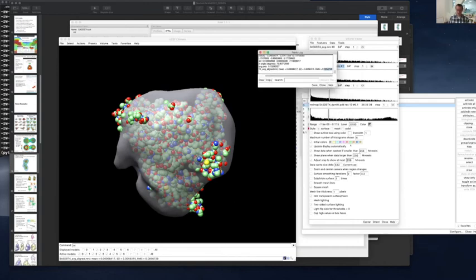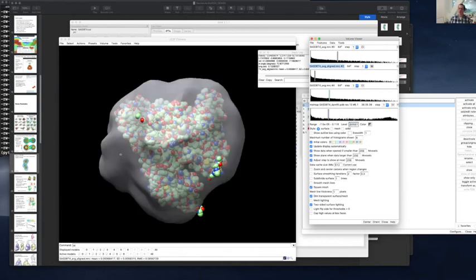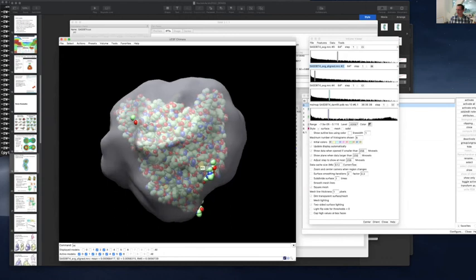So if it's 0.0056, you just pop that in here, and now you can see what 1 sigma is. You can see 1 sigma is too big, right?